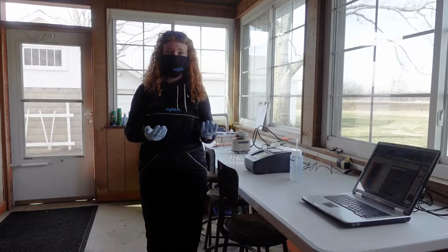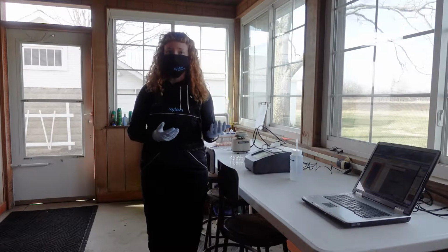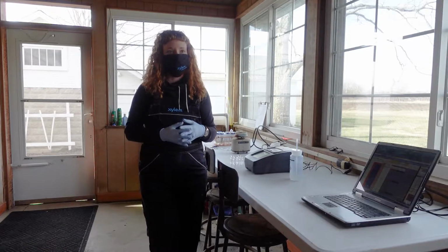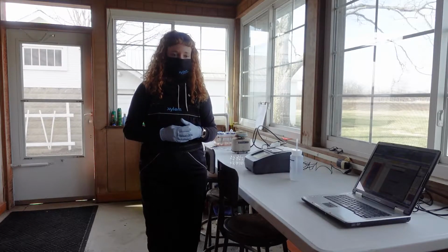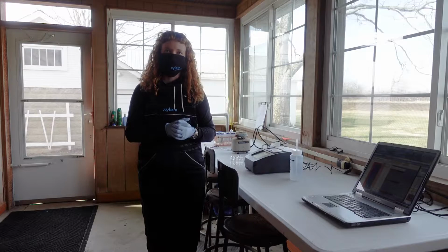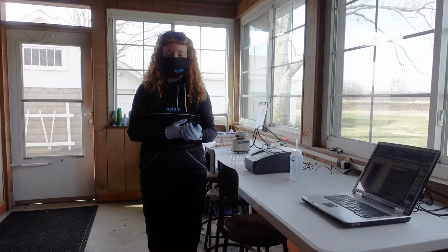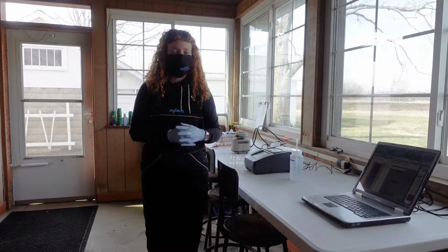Today I'm going to show you how we in our lab test for nitrates in our water samples. So nitrate is a nutrient. It's actually an ion in the water that could indicate the presence of fertilizer runoff or wastewater runoff into our surface waters. We care about this because nitrate, along with phosphorus, is an important building block for DNA, for algae and other organisms, and of course if we see an overabundance of nitrate, we can see an overgrowth of algae, which can impact our surface waters.